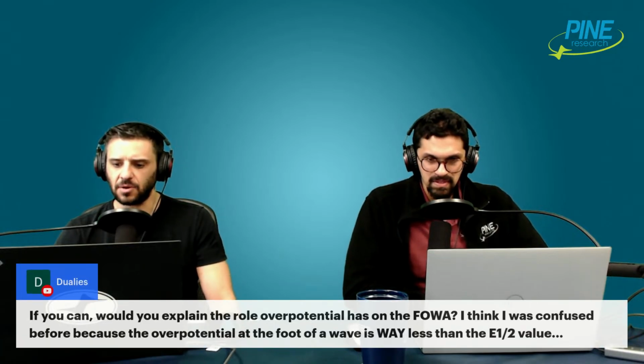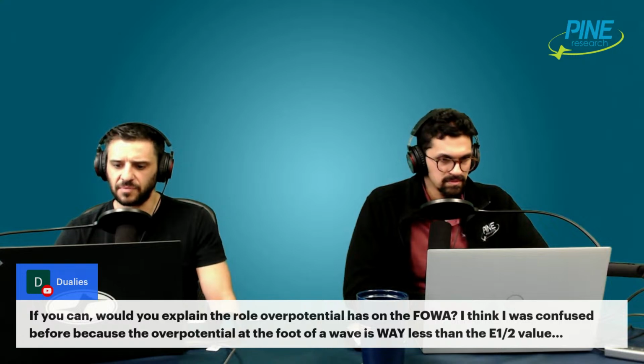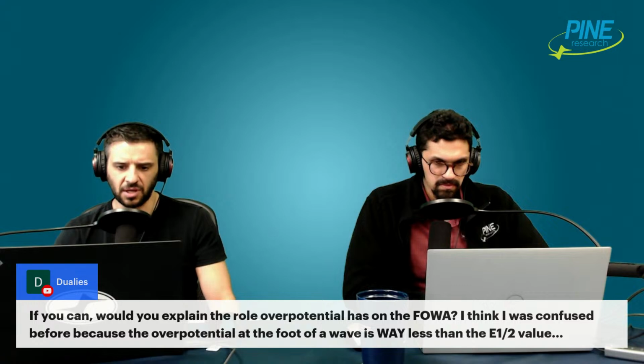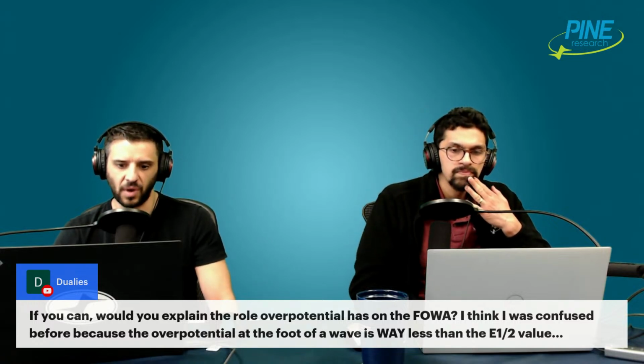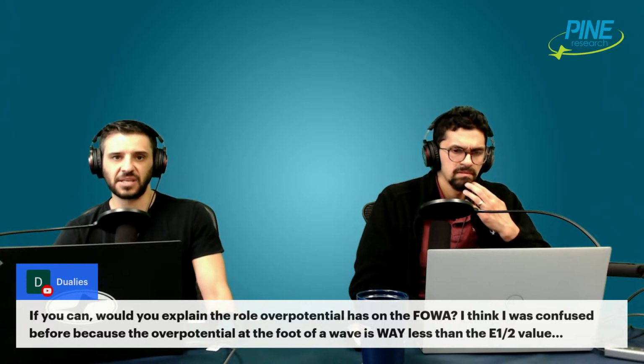Yeah. I think it's probably for the trumpet plots, because people end up going to very, very high scan rates and very low scan rates to look at it. But I think you can talk about this pretty well because you've made this discussion about Butler-Volmer and things like that. So Dooley's is back here to talk about the foot of wave. Basically, can you explain the role of overpotential on the foot of wave analysis? I think I was confused before because the overpotential at the foot of the wave is way less than the E1/2. That's correct.